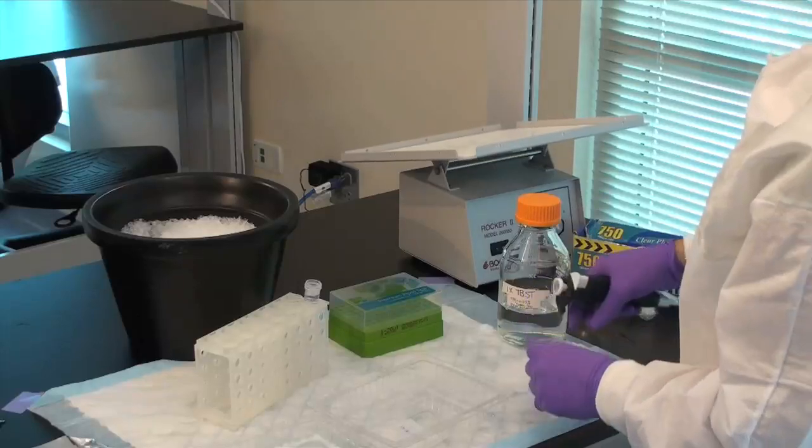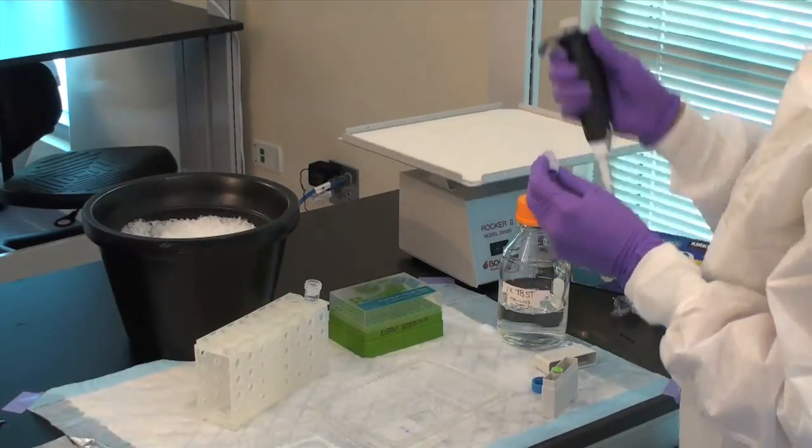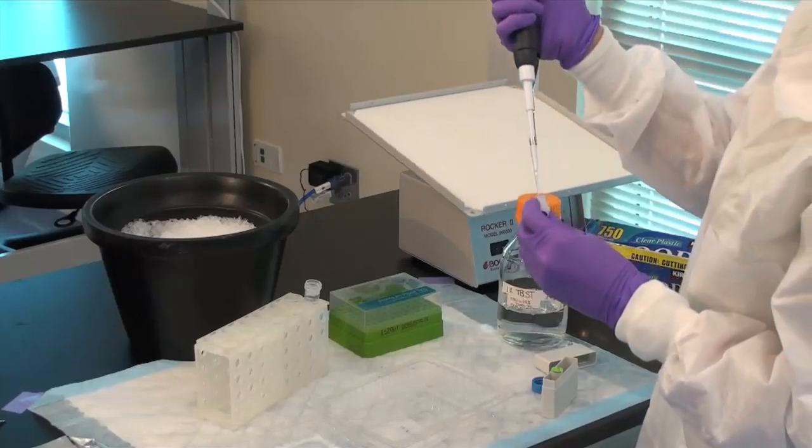Wash the membrane three times with TBST, then add the secondary antibody made up in TBST and place it on the shaker for an additional one to two hours.